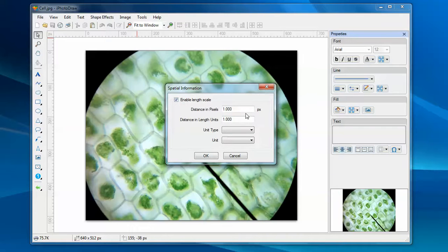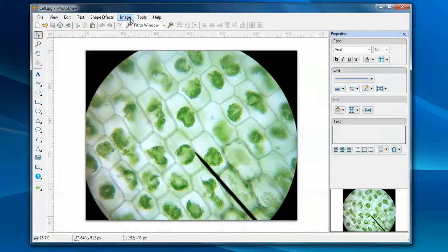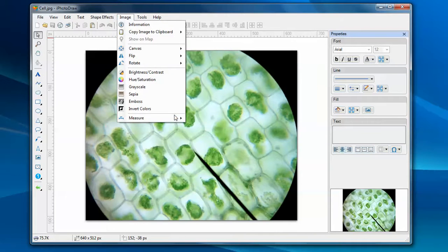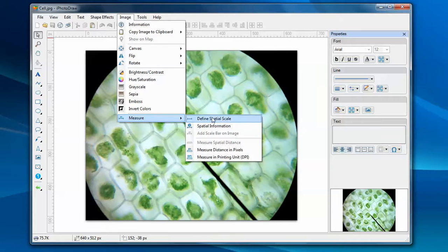Enter the information on this dialog. Or, you pick this define spatial scale menu item and define the spatial information directly on the image.